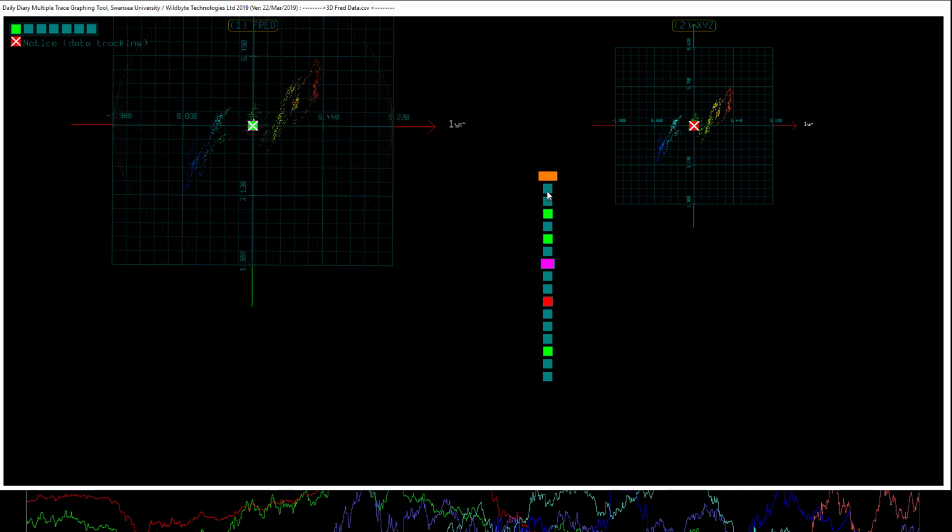What else? Okay, so each of these buttons up here, you can right click and it'll put a purple box around to show that these buttons here are extra attributes of this one here. See? So this is an orientation reset. If you right click, then you can use your mouse wheel. Down the bottom here, which vanishes when I move off the button, it shows the buttons on the mouse that interact with that button.